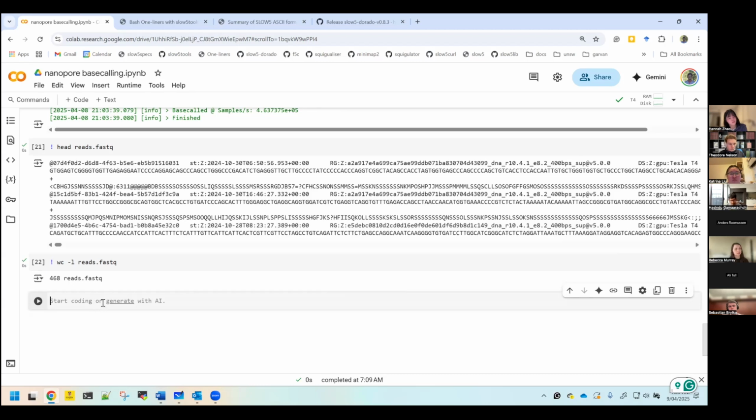Now, what we will do is try to visualize one of the reads using the squigualiser software. But before that, we have to connect the signal to the base calls, and do some alignment of the signal to the actual base calls. For that, we will use the software called f5c.